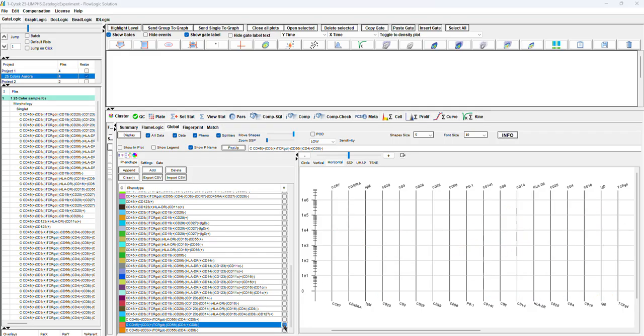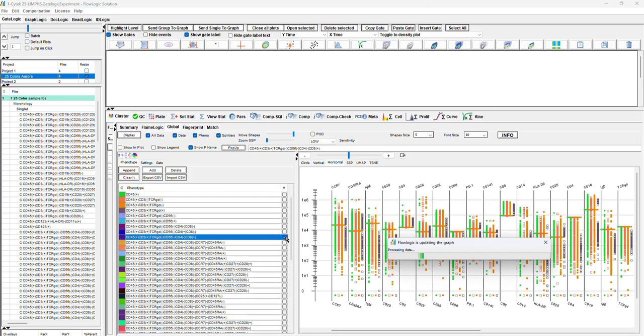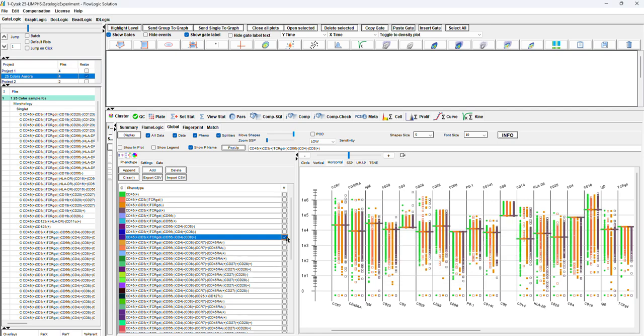If we want to see the original data, so the clusters, we can see the expression of the clusters, all the clusters that express. And you can see how CD3 is the cluster expressed in CD3, CD28, CD16. So you can see how the data is.